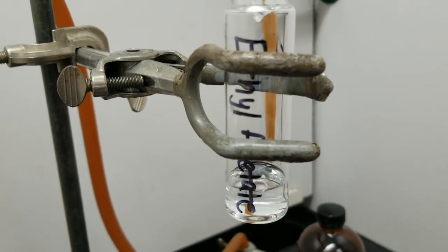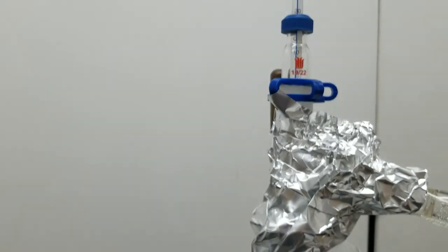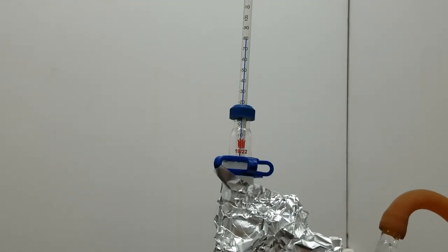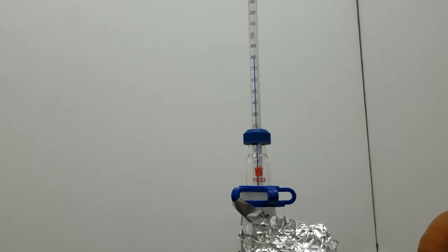So there's just a few things that I'm going to be looking for from here. I'm going to keep an eye on that temperature, because if I see the temperature on the thermometer get hotter, then that might indicate that the higher boiling point toluene is starting to collect on the thermometer, and I should stop collecting because my ethyl acetate is about to be contaminated. Conversely, I might also see the temperature drop, which would mean that all of the ethyl acetate has left the system already, and the toluene is now in the process of coming up and has not hit the thermometer yet. So right now, it's at this nice steady plateau right around the boiling point of ethyl acetate, and if I see it deviate from that, then I know that I'm done collecting the ethyl acetate.